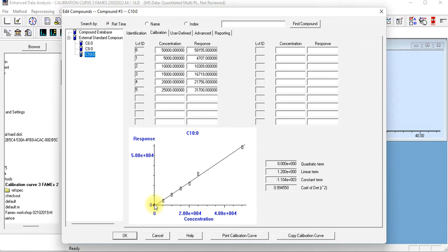How they compare between registered chemists. So usually, I managed to achieve 0.9999 at one particular time. But it's very hard.